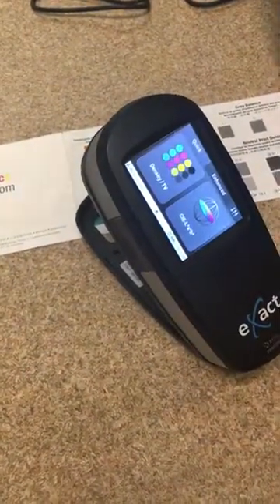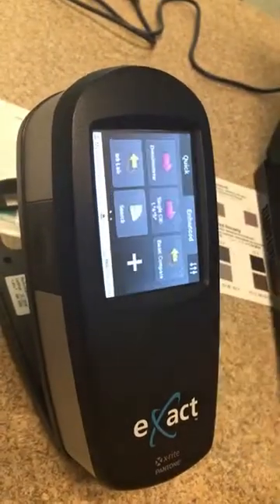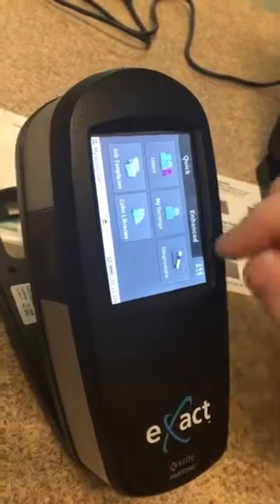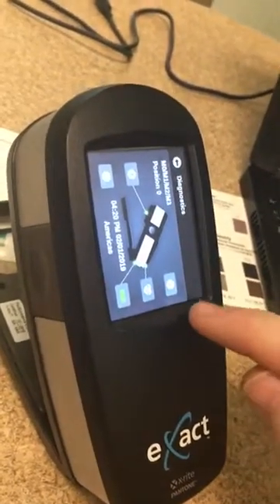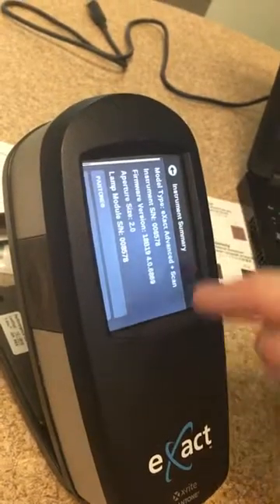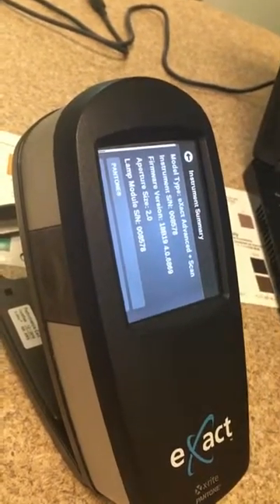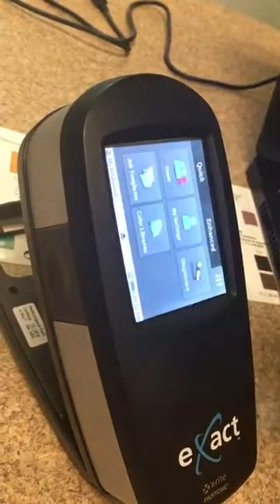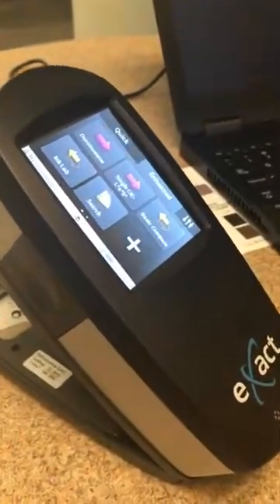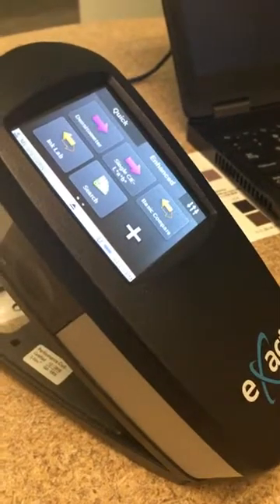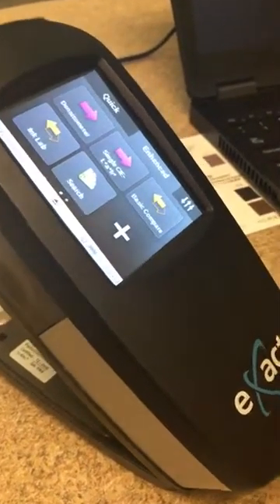The next thing I want to show you is the general layout of the instrument. First off, this is all touch screen — there are no buttons on this. We have a quick menu, an enhanced menu, and settings icons. If you go into settings, you can go to Diagnostics, which has an info button that will tell you what your instrument is — whether you have Standard or Advanced, and whether your instrument is scan enabled. Think of the icons as applications, like your iPhone has different apps all running on the instrument.